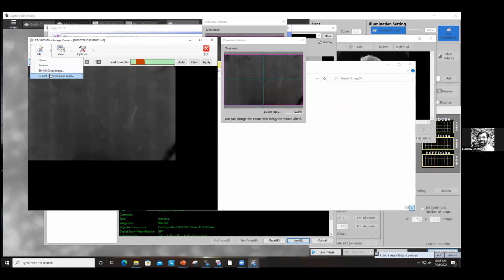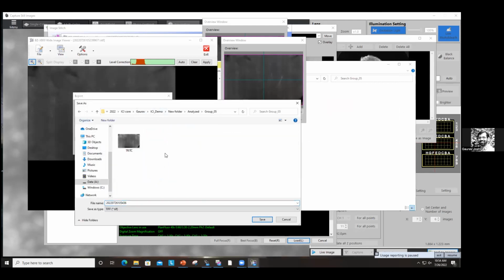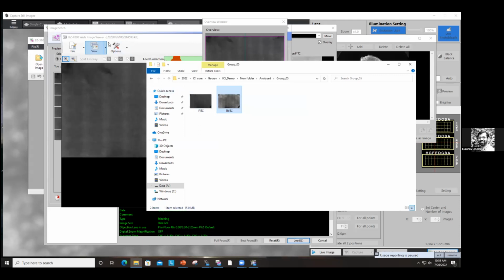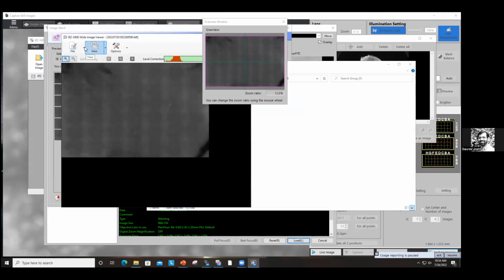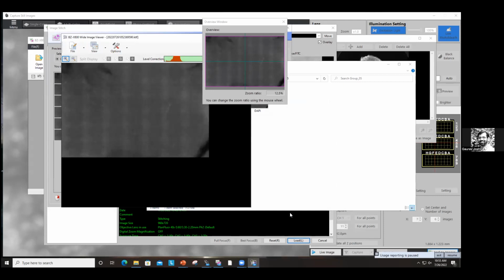Can save this as FITC. And my last one as DAPI. I'm happy with all of them.